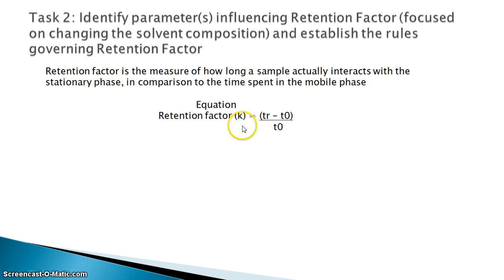And here I have an equation for you. So retention factor, which is k, is retention time minus unretained time, divided by unretained time.